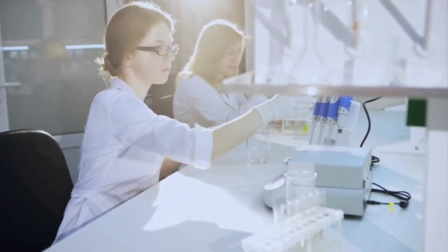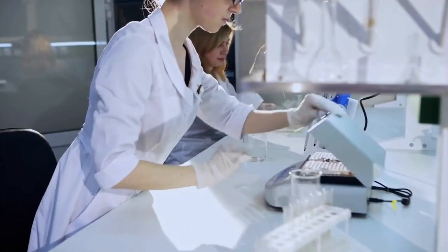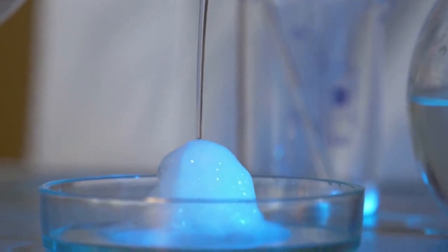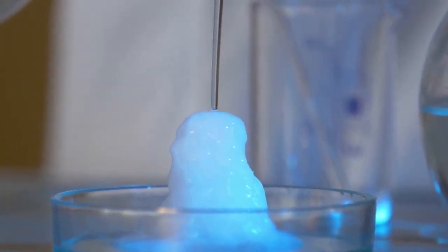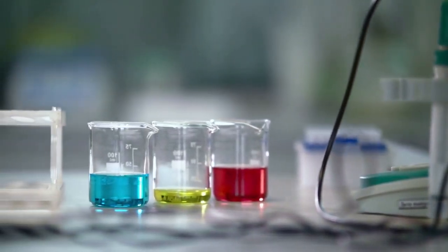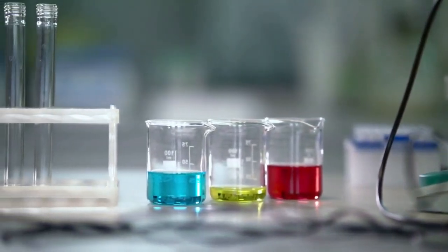First, let's define the basic retention time, which we call T_R. This is simply the total time a compound takes to travel through the entire GC system. The clock starts at the moment of injection and stops when the peak for that compound reaches its maximum height on the detector. However, not all of this time is spent interacting with the column's stationary phase.